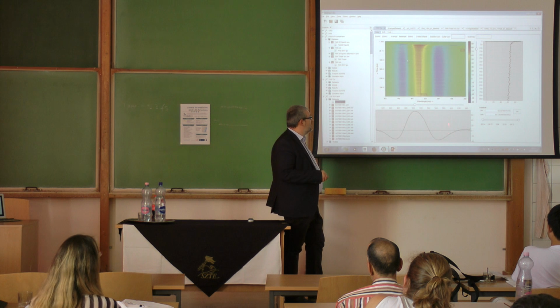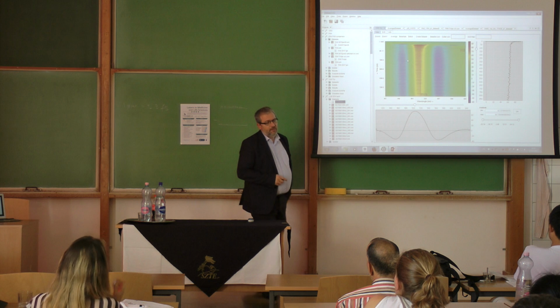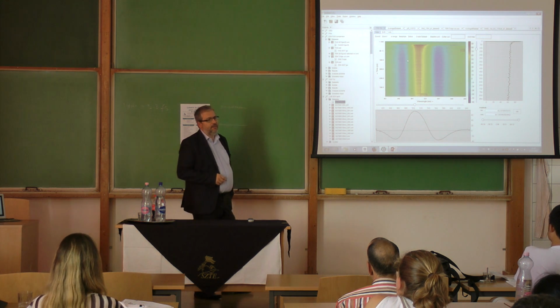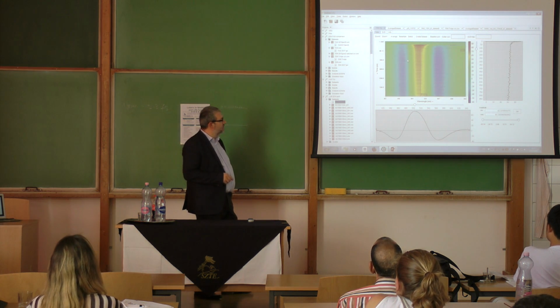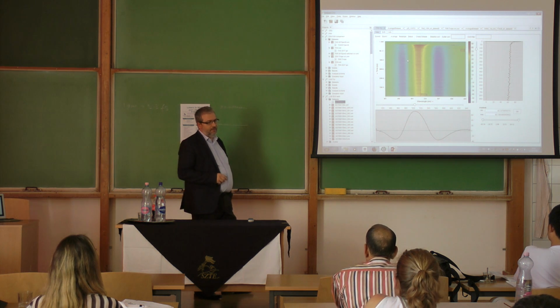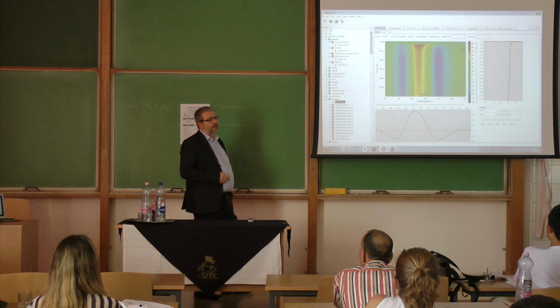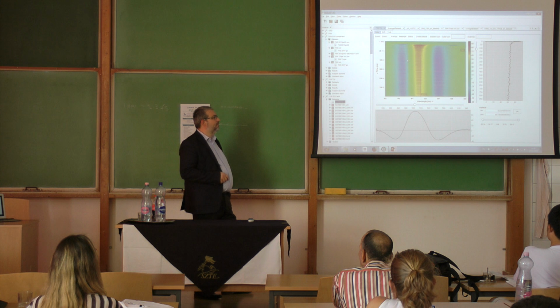What I didn't mention is that flavins have a very typical absorption in different redox states. Basically, what we can follow here is in which redox state the flavin is. That's why we need wavelengths, because we are following which peaks appear and disappear in the spectra. In this case we can assign what happened to the redox state of the flavin.